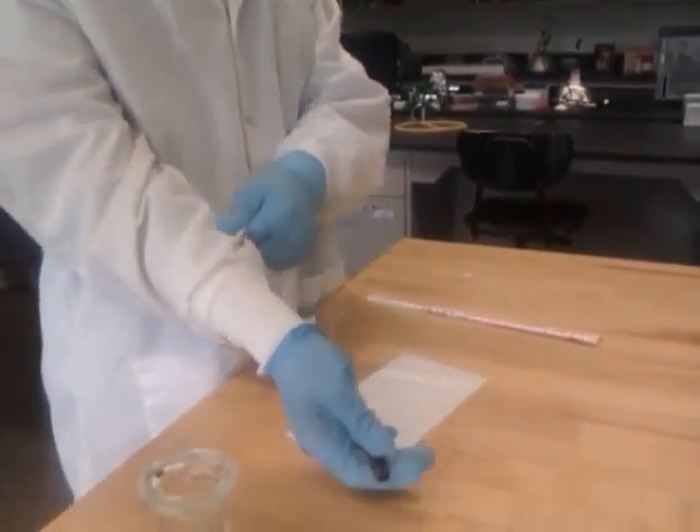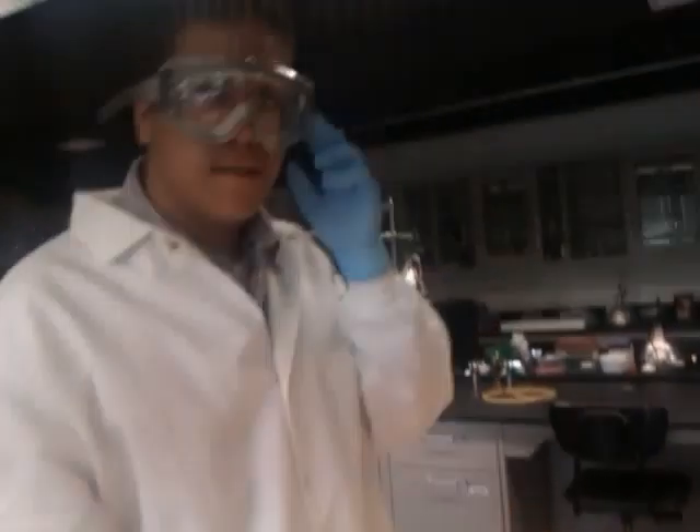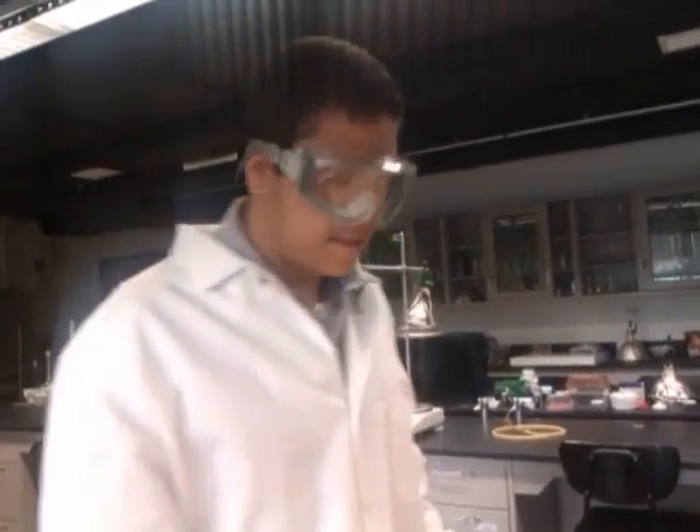Alright guys, I'm going to show you how to cut plates with thin layer chromatography. Before you cut plates you should wear gloves, lab coat, and goggles. Make sure no glass shards get in your face and skin.